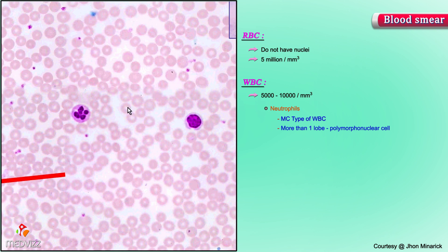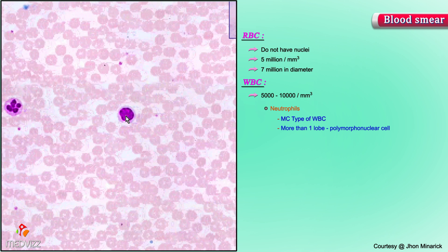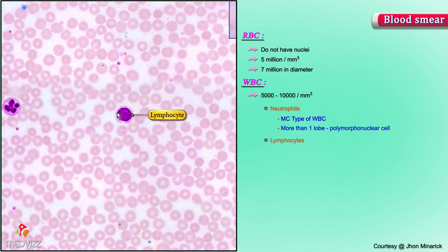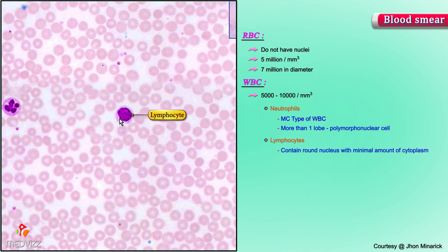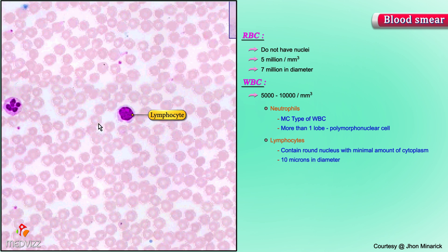The red cells average about seven microns in diameter, but the more reliable measuring stick on a blood film is a small round lymphocyte containing a round nucleus and a minimal amount of cytoplasm. The diameter of these is about ten microns fairly reliably, which you can see is a little bit more than the seven microns of the average red cell.